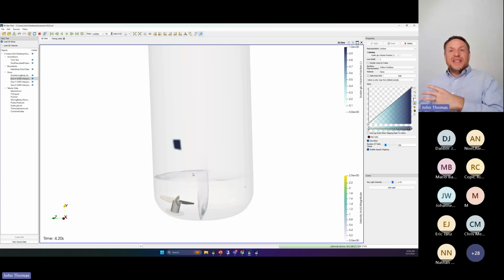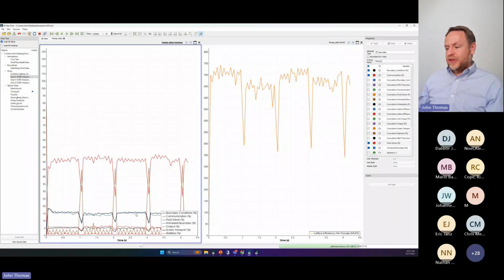This means we can do things like coupled viscosity relationships. We can have the viscosity changing in time as the concentration changes, and we get that for free, right? We get that for free because there's no additional expense associated with calculating that viscosity because I already have the concentration. So again, monitoring performance here, this looks good.